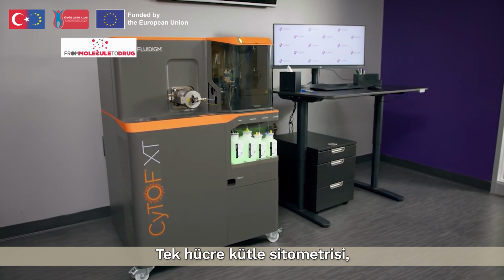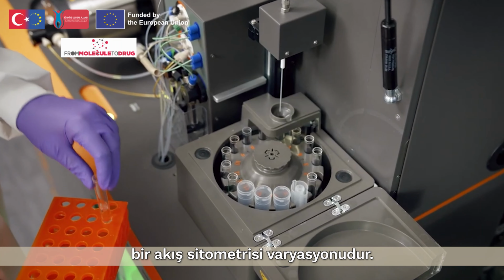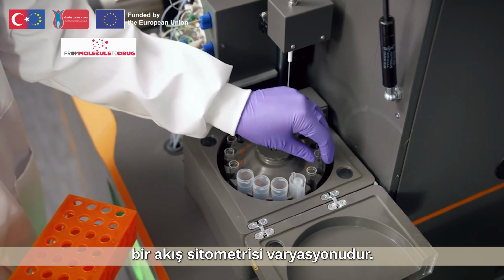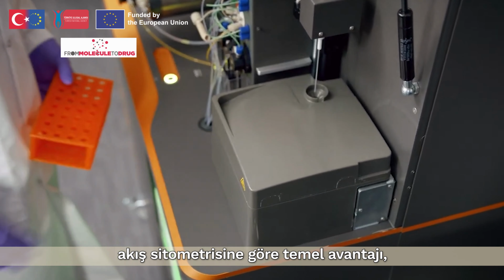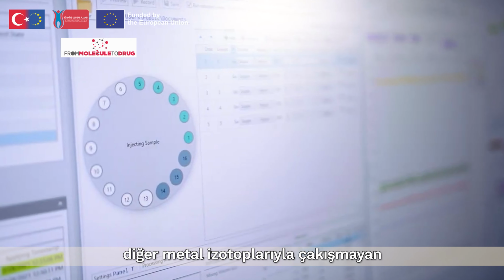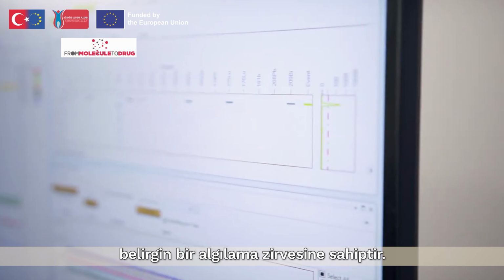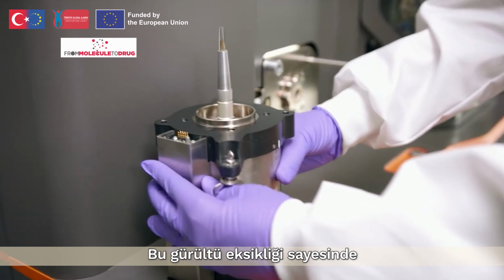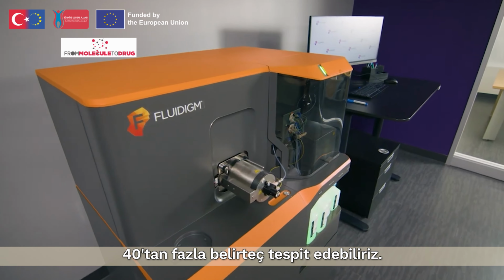Single-cell mass cytometry is a variation of flow cytometry in which antibodies are labeled with heavy metal ion tags rather than fluorochromes. The core advantage of mass cytometry compared to flow cytometry is that there is almost no background noise, as each metal isotope has a distinct detection peak and doesn't overlap with other metal isotopes. Because of this lack of noise, we can simultaneously detect more than 40 markers from a single cell.